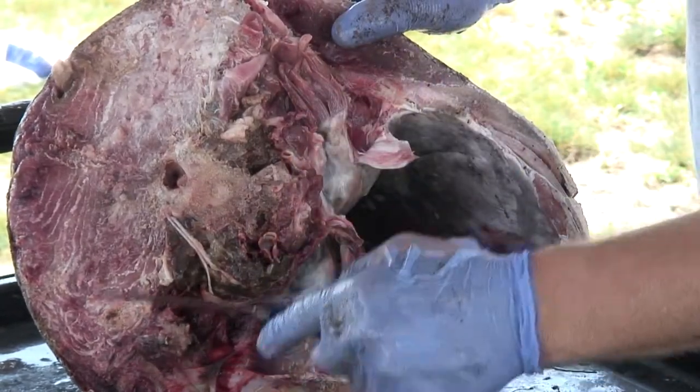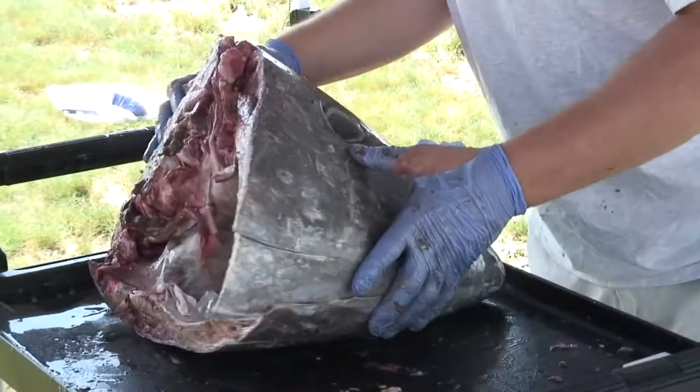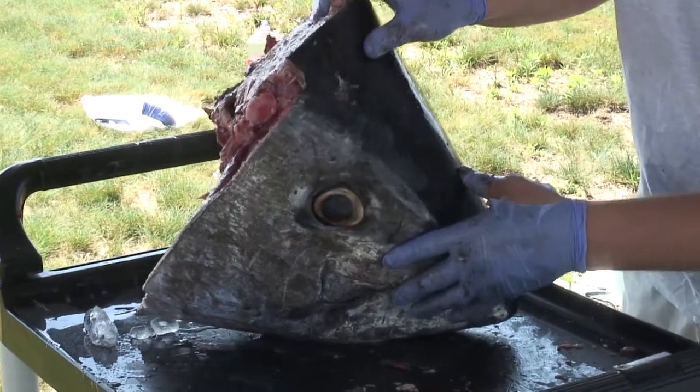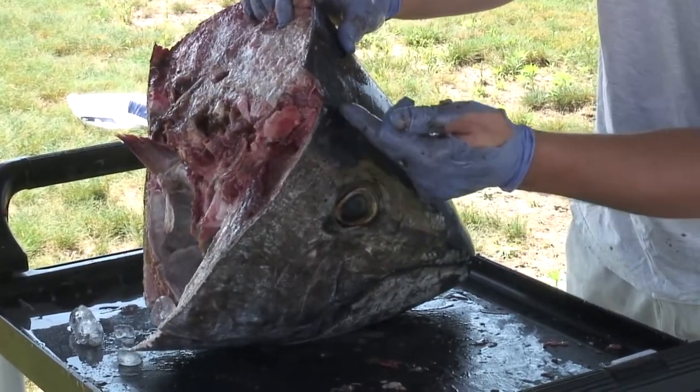If you want to cut, looking at the back of the head, you want to do so right across the top here. And then from a side profile, you want to match that cut up across the back, across the top of the eye about a half an inch.